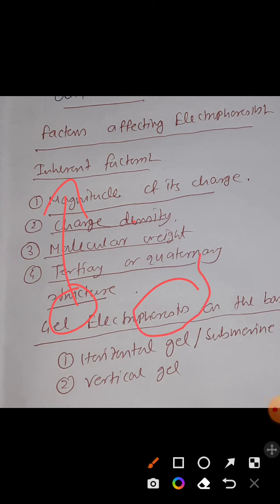Here we are using a medium. In case of DNA separation it is agarose, which we will discuss in upcoming videos, and in case of protein it is polyacrylamide gel. These gels provide pore-like conditions throughout the medium, by which small molecules get the opportunity to move faster than larger molecules. So suppose you have two molecules of the same molecular weight; the compact molecule will usually be smaller in size than the extended molecule, so the compact molecule will have the opportunity to move faster.